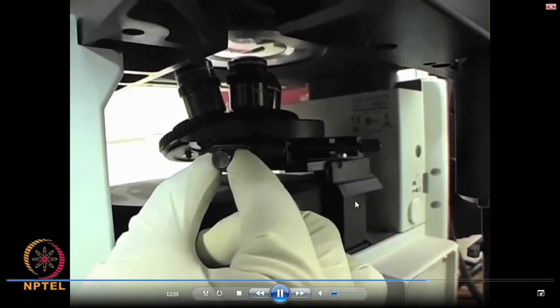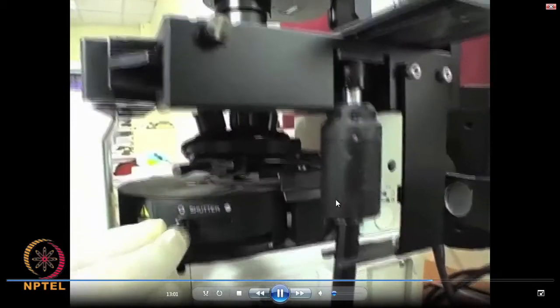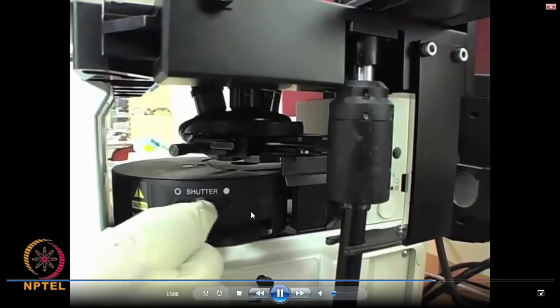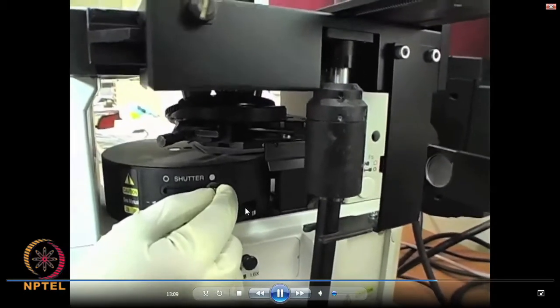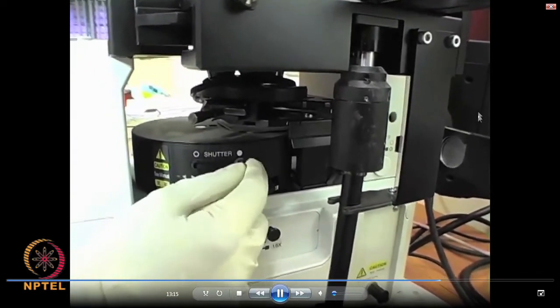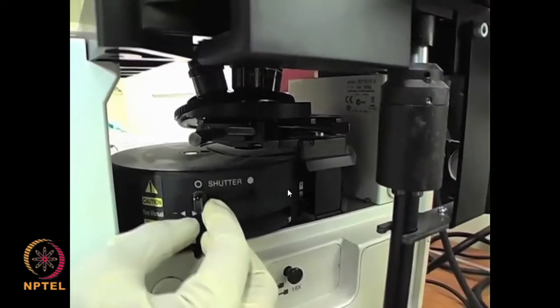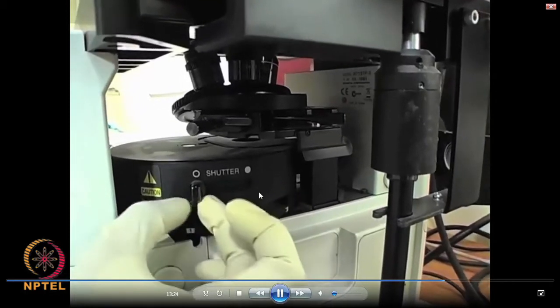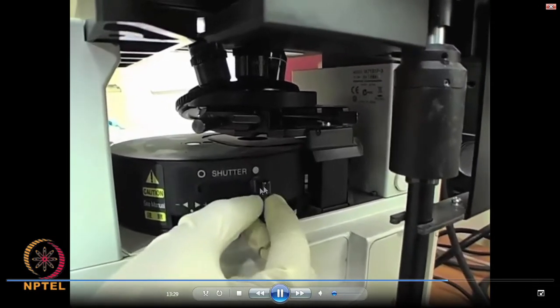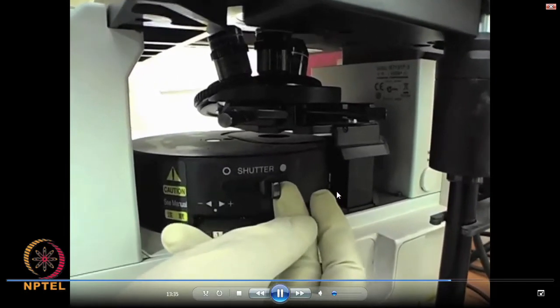So now we will see another set of condenser apertures just below this shutter. This shutter is meant for operating the bottom illumination, which is the mercury lamp. In this microscope it is used only for fluorescence mode. When you want to perform fluorescence microscopy, then this is kept on. This is the on position, the mercury lamp will be on, and when you put it back, then it is in halogen lamp mode.